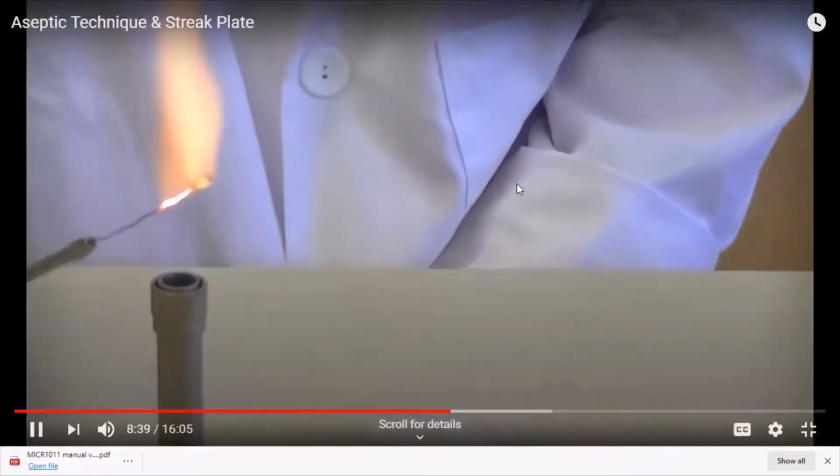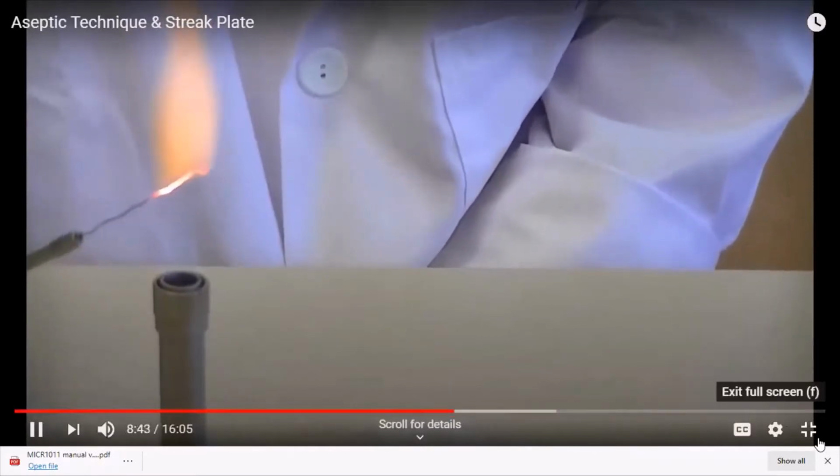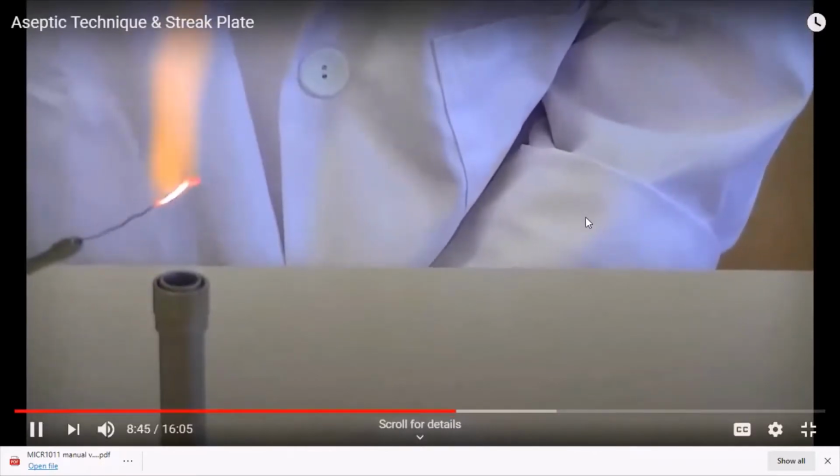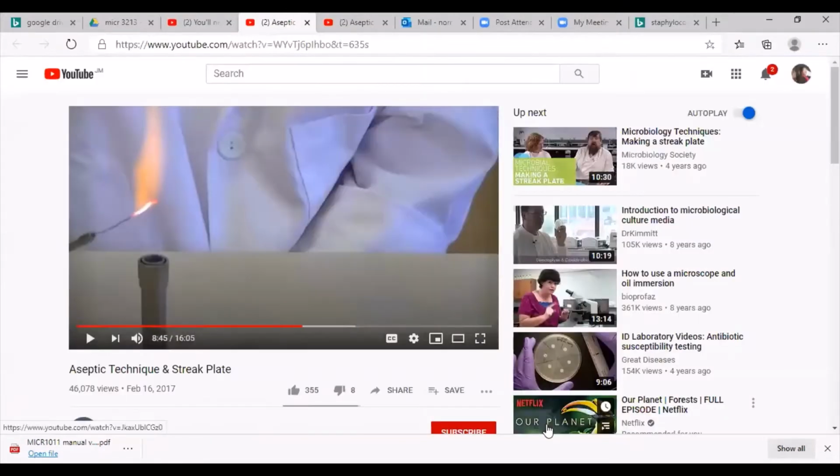You need to flame your loop once you've completed the procedure to make sure you remove any bacteria that might be on there. Okay, guys, so I just want to show you over how the plate usually looks after you finish the streaking. So let me just show you how it looks again for those who probably forgot.